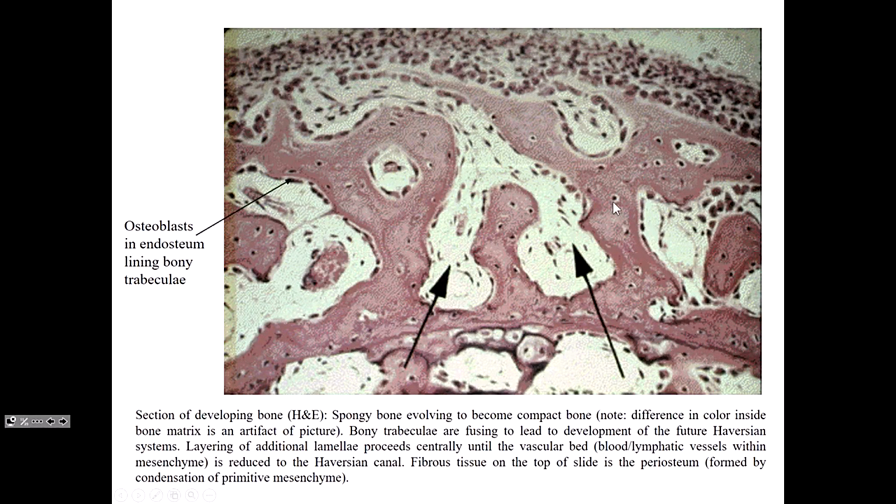Yes. The circles here are blood vessels. This is a blood vessel. This is a blood vessel. We haven't done cardiovascular yet, but yes, it is blood vessels.